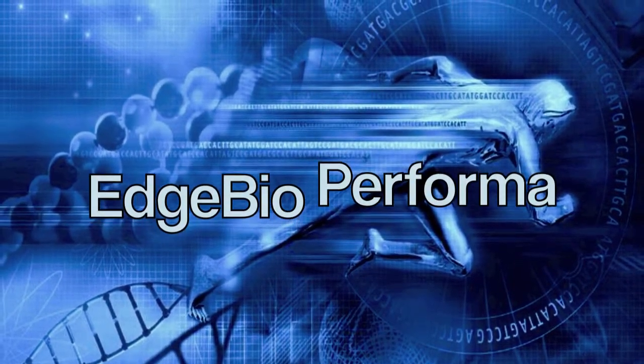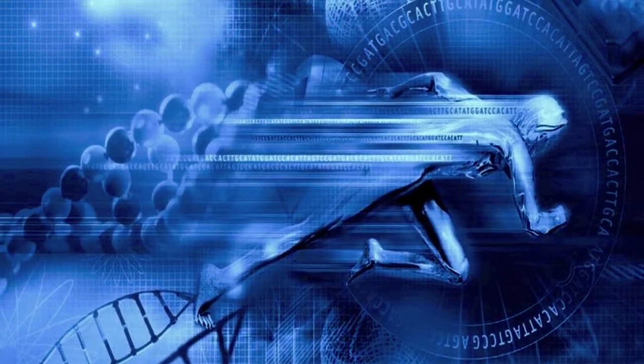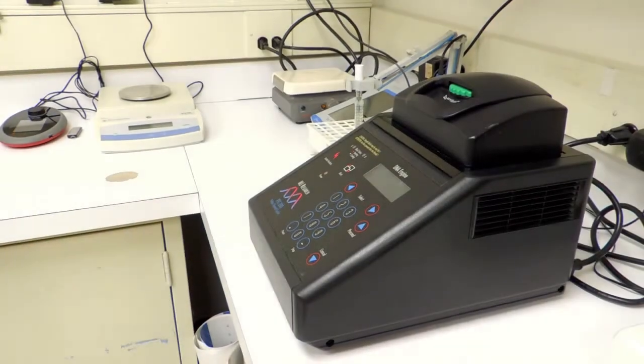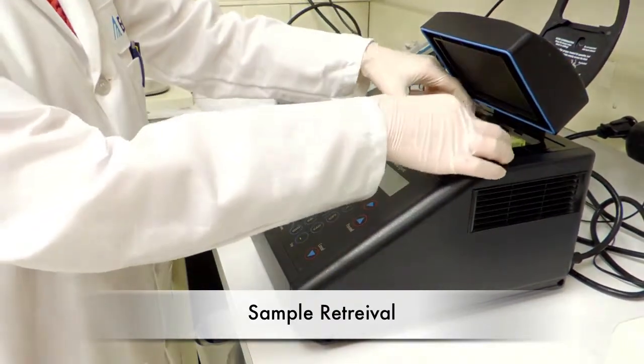The following is a video demonstration for EdgeBio's Performa DTR products. Our Performa line is used to clean up reaction samples before they are sent off for sequencing.